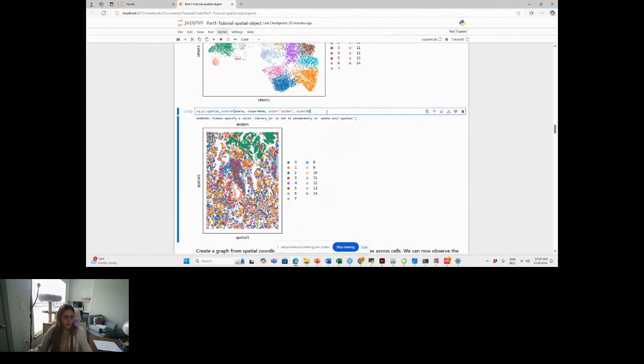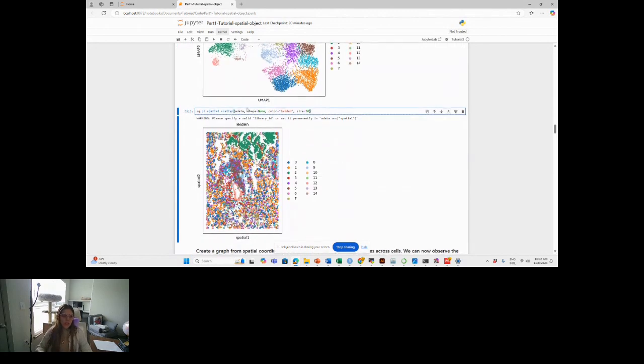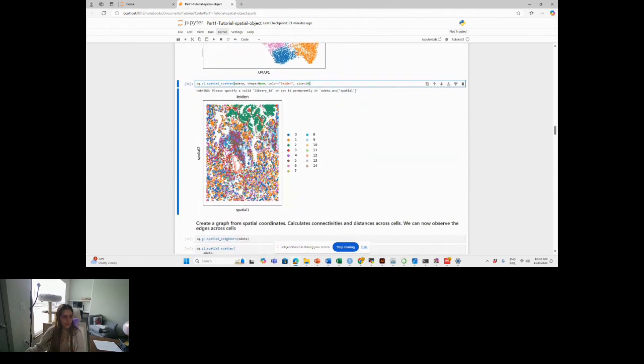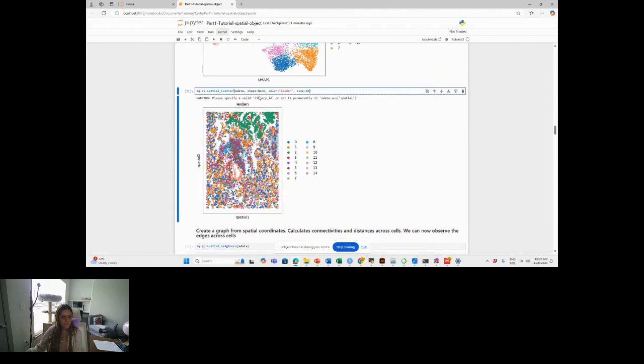Yes. Okay, and then the next step is to visualize now the spatial location of the cells. So the clusters in here are going to be the same. This group of cells, we can see that they are spatially located in this region. So basically now, instead of visualizing the UMAP, we're visualizing it in spatial locations. So we have several cases, right? In the case of the green, we can see that they form a cluster in the UMAP. You go a little up.